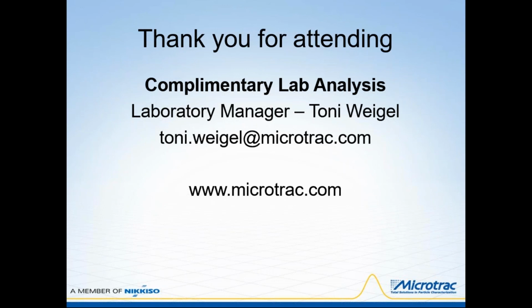Great, okay, and we have two more questions. One from Mike, is the data easily extracted to Excel? It's extremely easily extracted to Excel. If you copy the image file that shows all the parameters for all the particles, it goes right into an Excel spreadsheet.